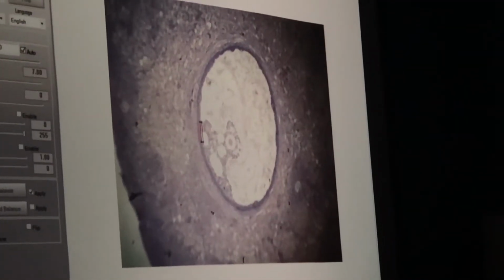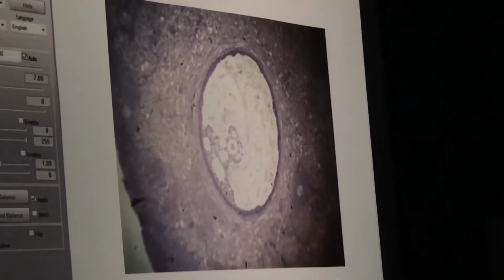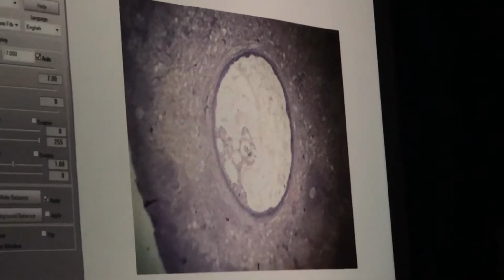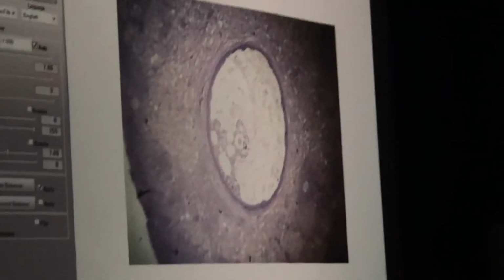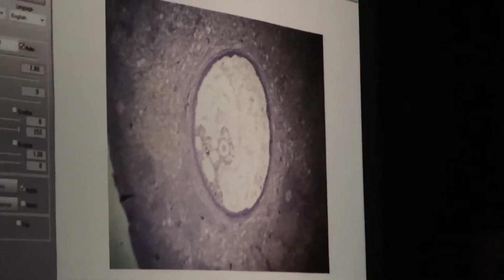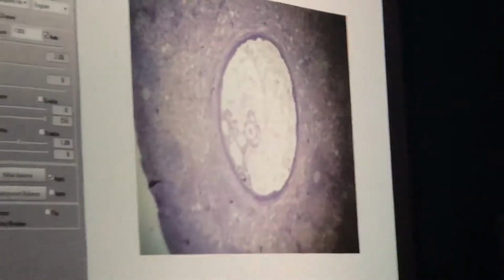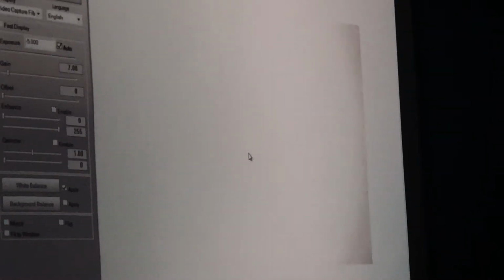What was that? Granulosa cells. So that's the follicle wall there. The white in the middle is going to be what? The antrum. This pink thing that I have right here is going to be my ovum. The cells here that are attaching the ovum to the follicle wall, cumulus oophorus. And then I'm going to go up to a little bit higher power because I want to take a little bit better look at my egg here.